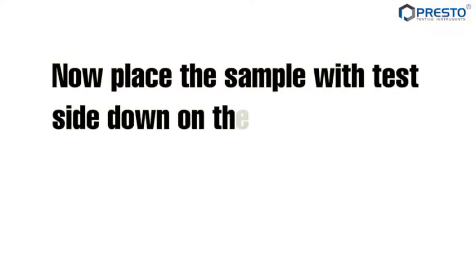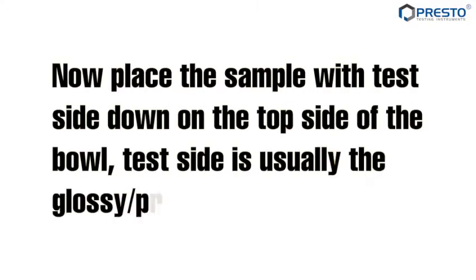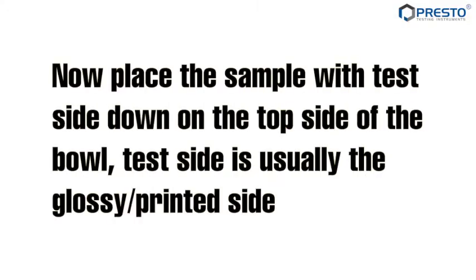Now place the sample with test side down on the top side of the bowl. The test side is usually the glossy or printed side.